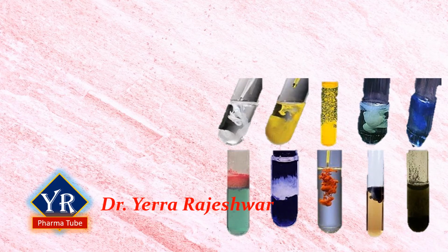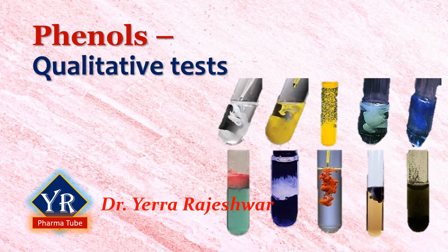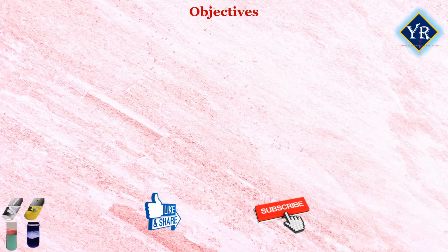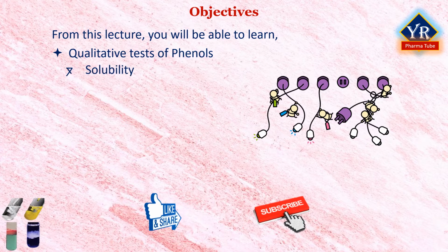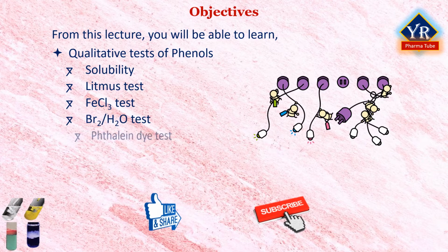In the last lesson, we learnt an introduction to phenols, the acidity and the effect of substituents on acidity of phenols. In today's video, we discuss the qualitative tests of phenols. From this lecture, you will be able to learn the various qualitative tests of phenols such as solubility, litmus test, ferric chloride test, bromine water test, phthalein test and Liebermann's test.